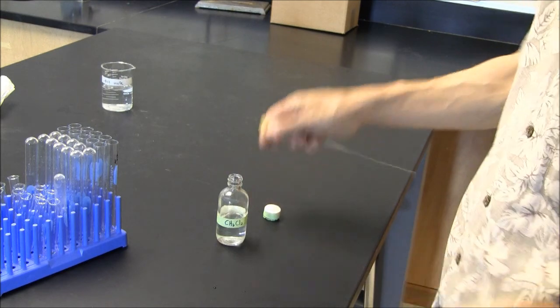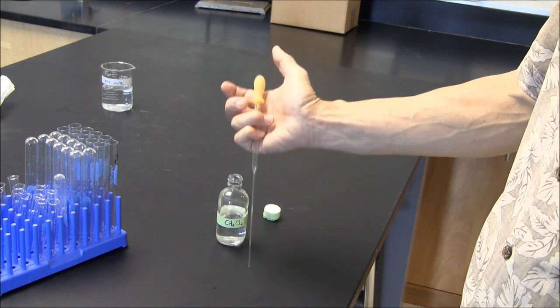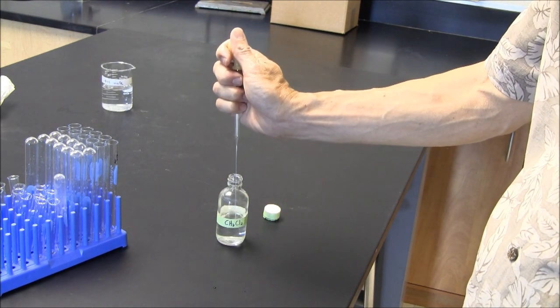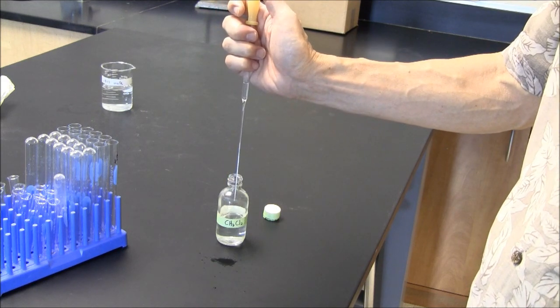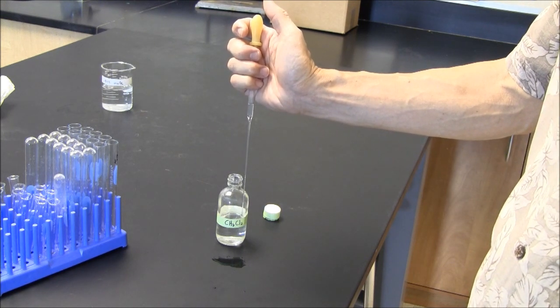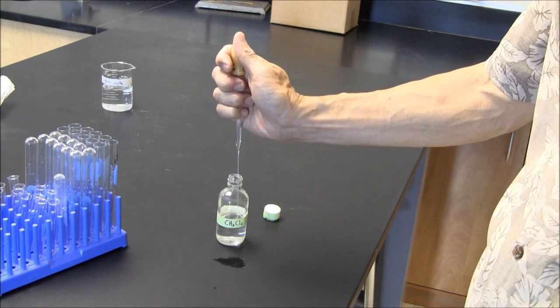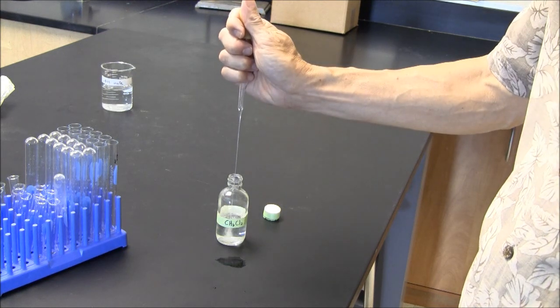So, when you're pipetting dichloromethane, notice I've got two fingers on the pipette this time. A little different style than last time. Often, if you do this, you can see it just drips out. And it's because my body heat is warming the vapors in the pipette and producing pressure that forces the liquid out. So, if I'm pipetting dichloromethane, it's a good idea to pipette up and down a couple of times.